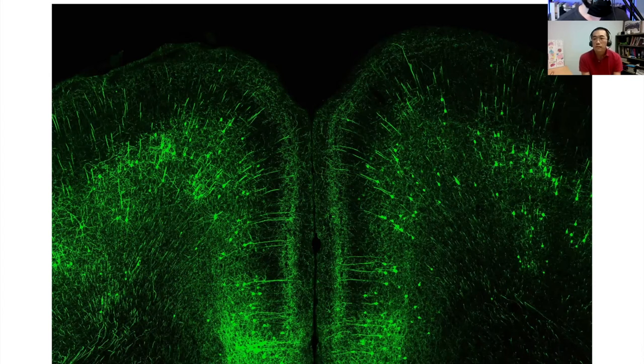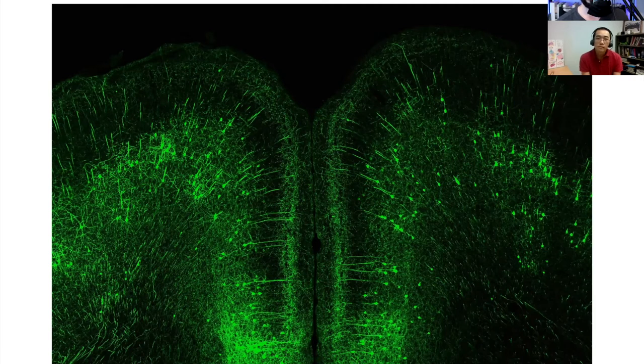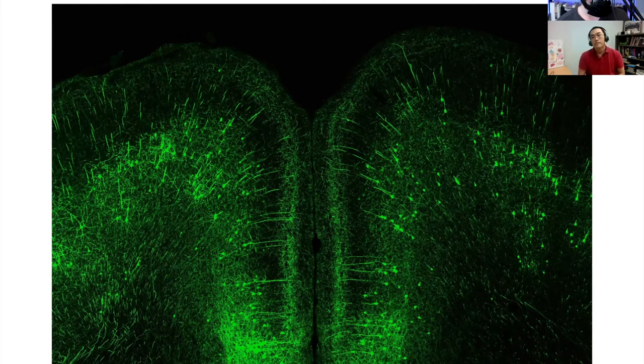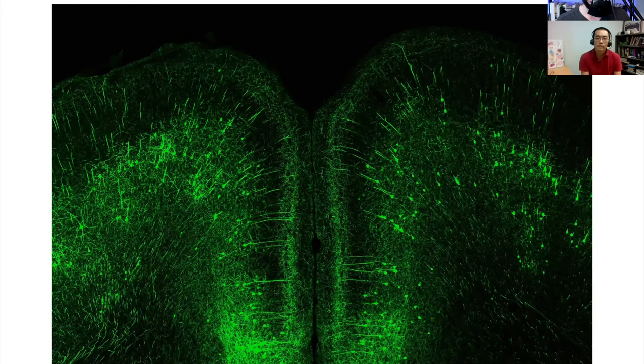I see. So for those listening, we're looking at a still image. You can see these bright spots and these bright lines on the image, and it looks like a glow in the dark color almost. That's coming from these neurons in this mouse brain that have been specifically engineered to fluoresce, to emit light so that they can literally see them. So you see these blobs in a certain part of this section - those are the cell bodies of the neurons. And these lines are the branches, the dendrites you were talking about, Alex. And those, you said, they're sort of reaching up and they're probably listening or connected to thousands of other neurons?